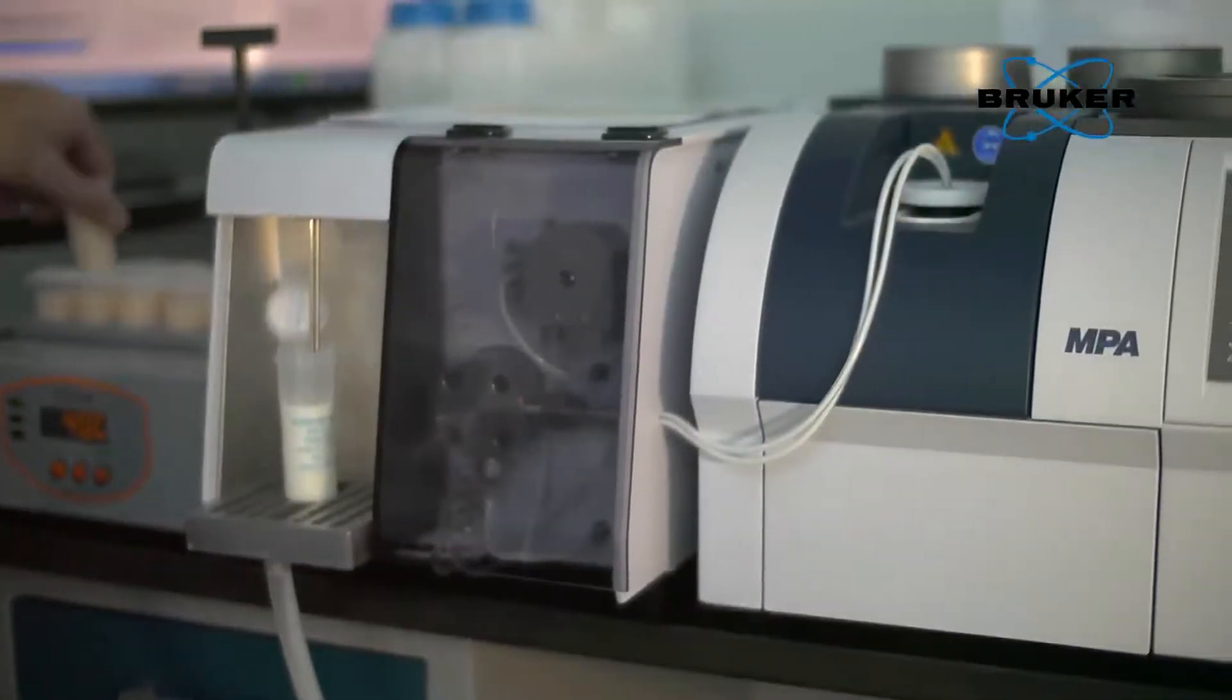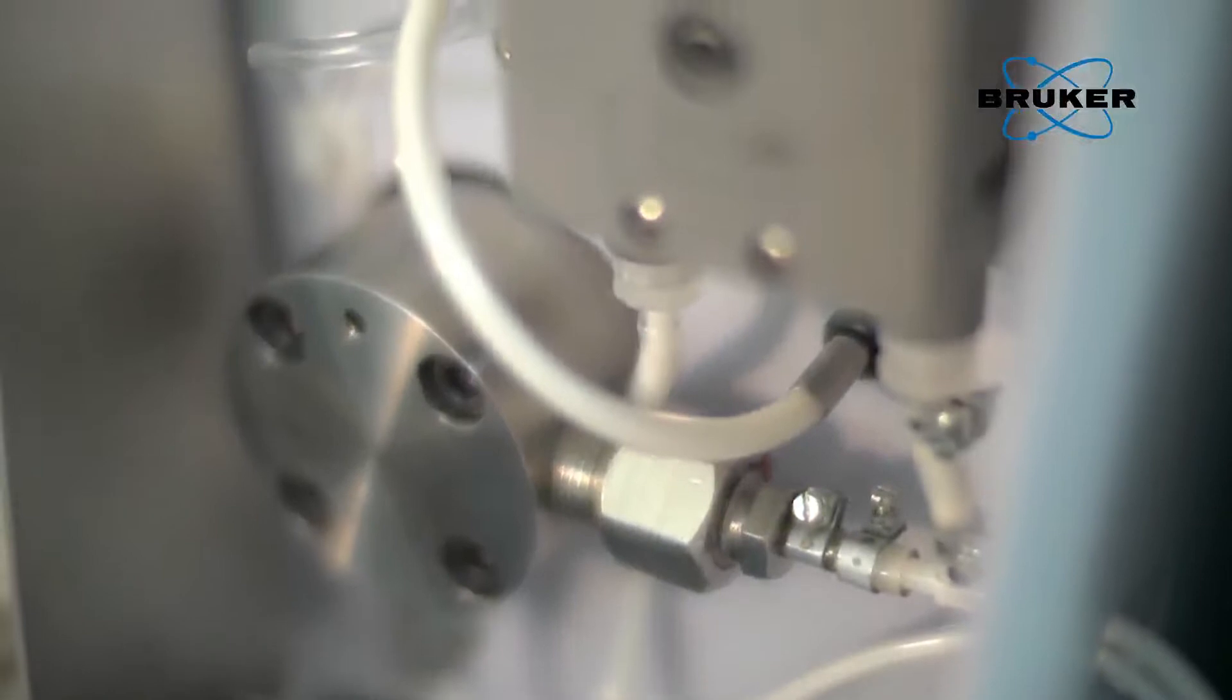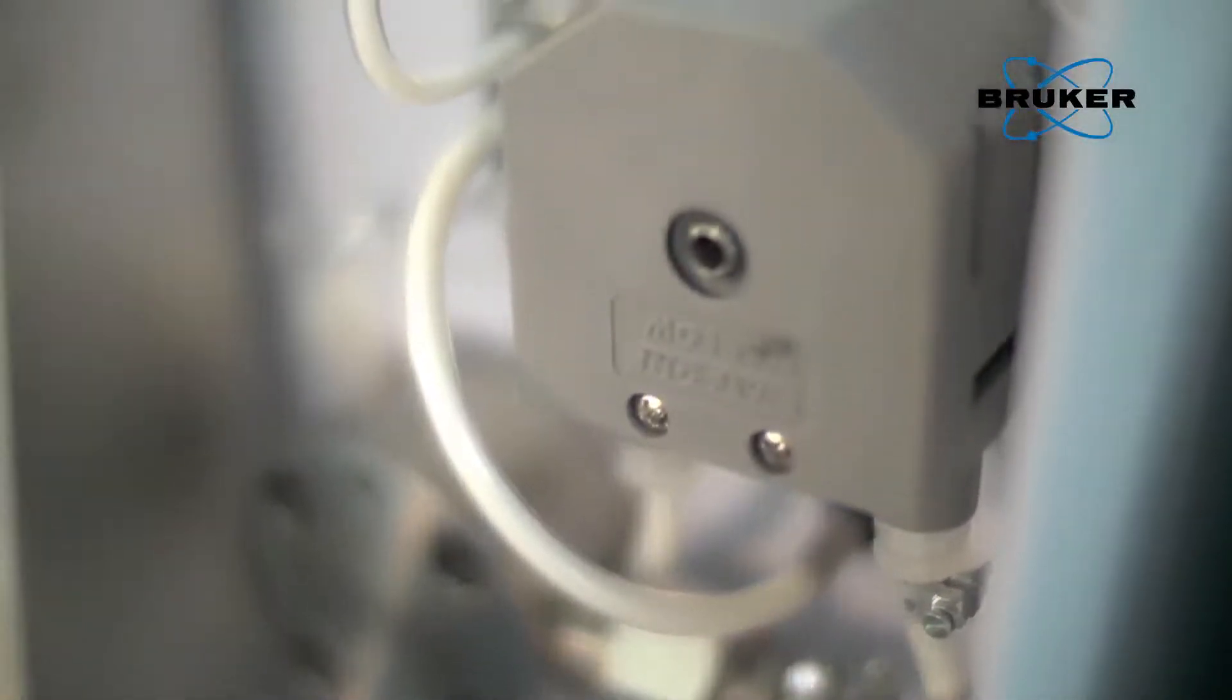Fourier Transform FT technology applied to the near-infrared NIR spectral region delivers the same performance advantages that revolutionized measurements in the infrared IR region more than 30 years ago.